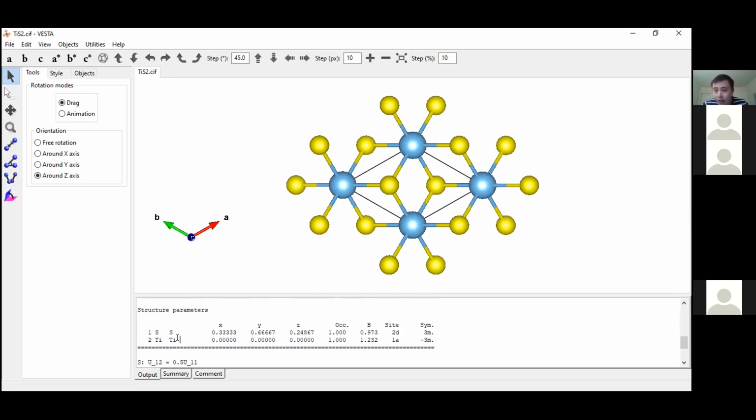So part of the iron occupies the tetrahedral site, which in the spinel framework is usually the 8a Wyckoff site. And some of the iron occupies the octahedral site, which is usually the 16d site. So the same atom can occupy different sites. But here we have only two kinds of atoms and also two kinds of sites. And we can look at their details.